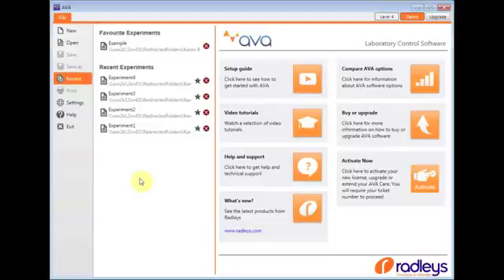I'm the Technical Manager here at Radley's, and I'd like to introduce the all-new AVA software. This is a very quick introduction to the various features of AVA. There's other videos available that go through things in more detail.